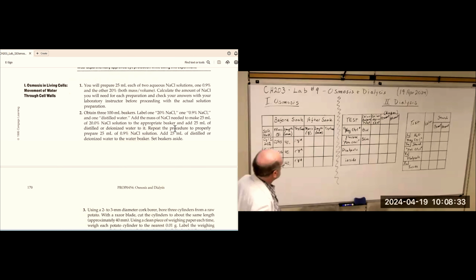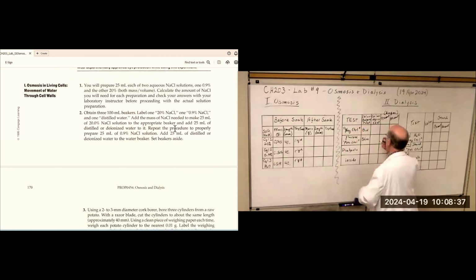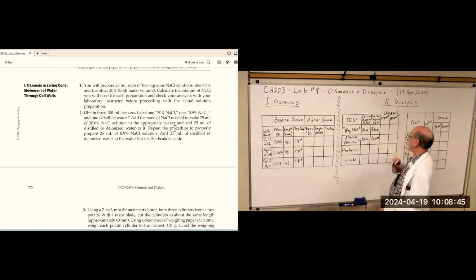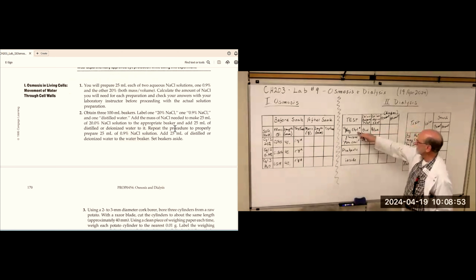So the negative control is still blue, right? Yeah. This one turned brown. Okay. Oh, so what does that mean? That means in the negative control, sugar's absent. And in the positive control, sugar's present.